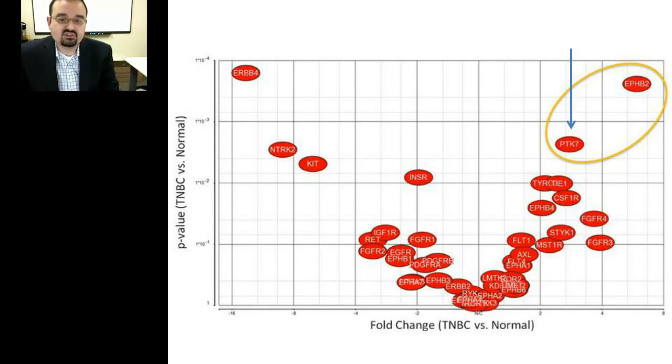Here is the cell line MB231, which was actually the most resistant cell line to these inhibitors. And even in the most resistant cell line, we see nice sensitivity of these cells to these PI3K, AKT, and mTOR small molecules, such that when we test these inhibitors across the triple-negative breast cancer cell lines, we see many of our results in the nanomolar IC50 levels.